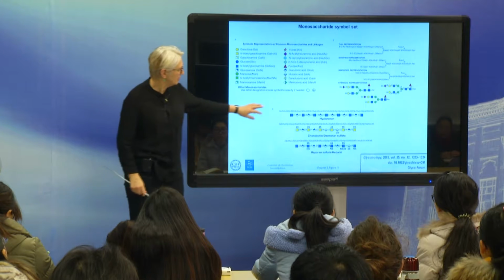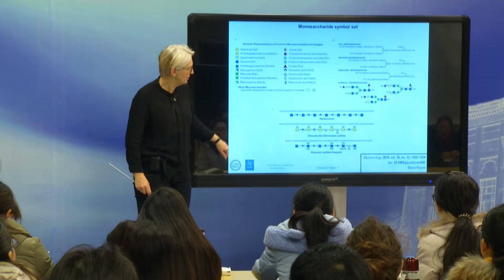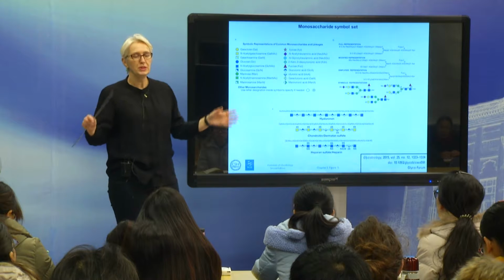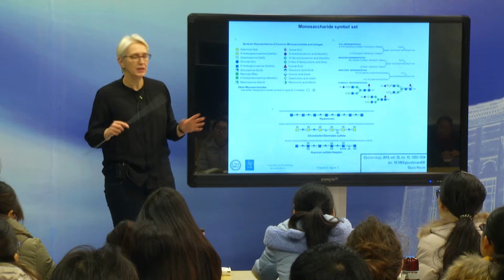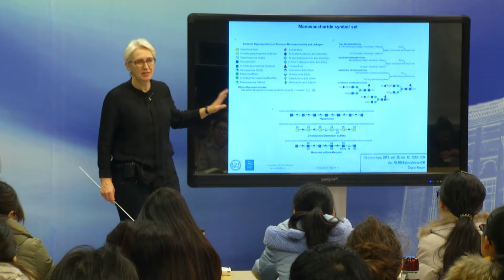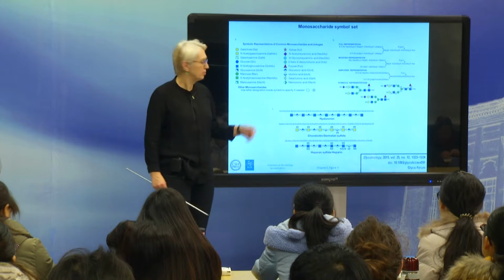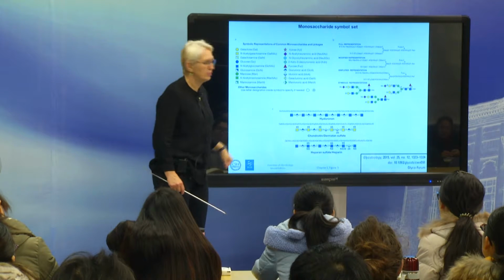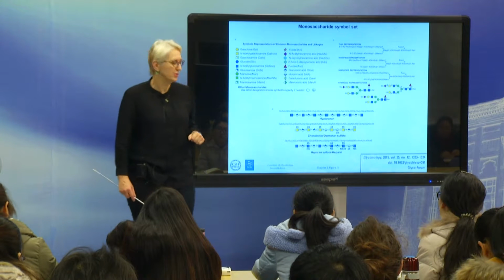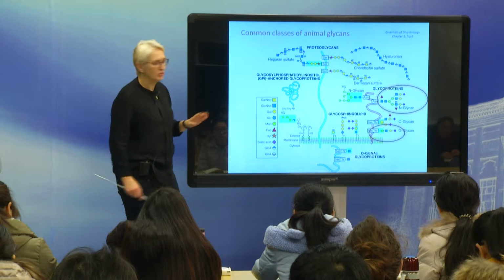So this is a very recent development in glycobiology, and as I said, if you work with sugars, I strongly recommend you use that right from the beginning. There's also software which allows you to build this, glycan builder software and so on. So we've been trying to make these structures more accessible to the general community, and also to biologists in particular, who are not structural people. So that's how we present them. This is almost equivalent to using ribbons in presenting proteins. Right, so let's go back to these. So you can see they're not very homogeneous.